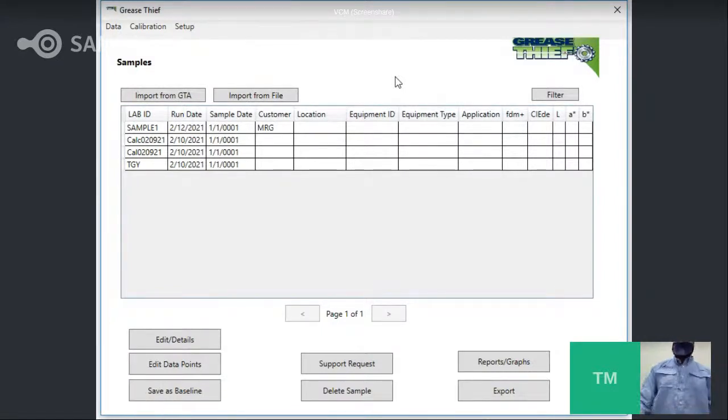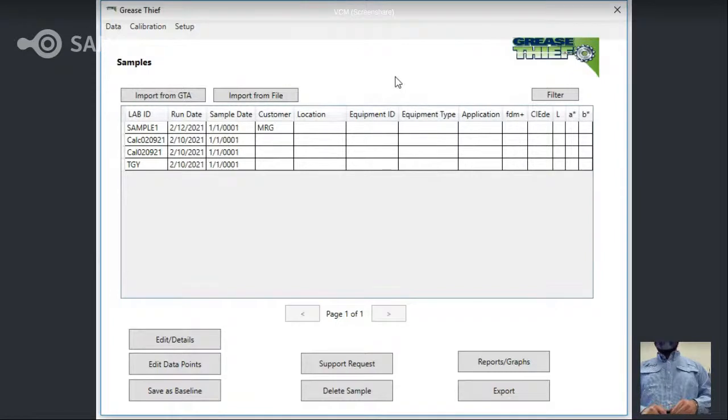Yes, when you see clog on the sample results, the extrusion die got clogged in the process. So likely that means that there was an accumulation of particles that would have required a force that would hurt the load cell, so it's prevented from causing damage to itself in the force reading, and it would be stopped, yes.